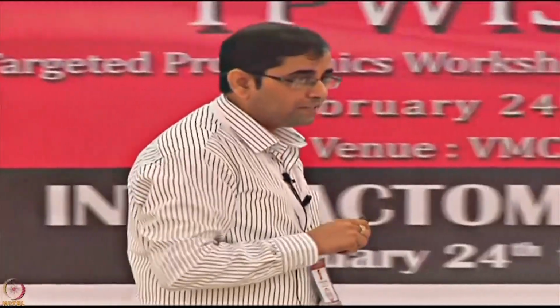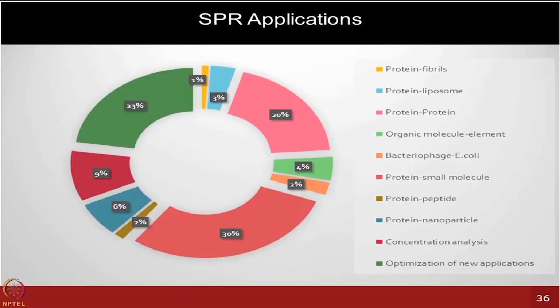And I am also running a core facility which is offering services for many types of applications for internal users and external users. This particular distribution shows that we are doing all kinds of applications here, from protein fibril interactions, protein liposomes, and protein with various organic molecules. And one interesting experiment came when somebody wanted to print bacteriophage virus on the chip and test with E. coli whether those binding can be seen or not.